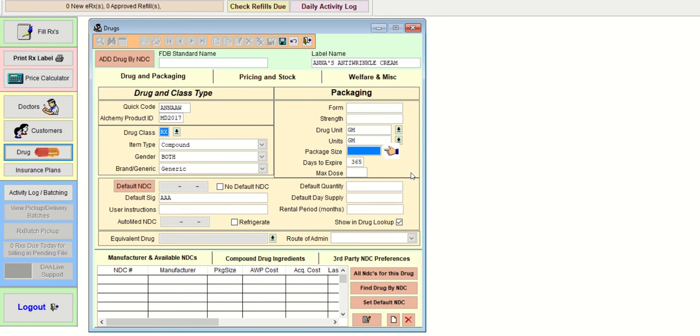Alright, does it tell us a package size? It says, no, it doesn't say. It doesn't even show it in the picture. So let's skip it for now. But normally you'll put the final package size here. Alright, it says save. So this is the default label information we need to make first.